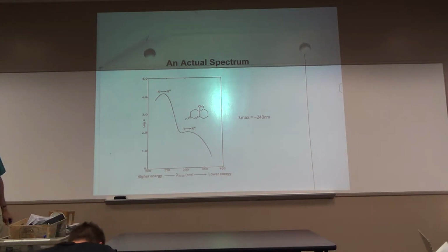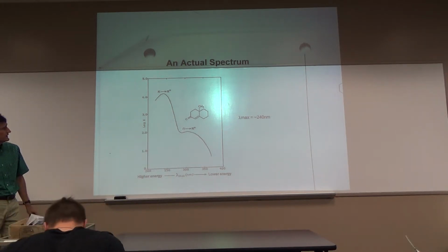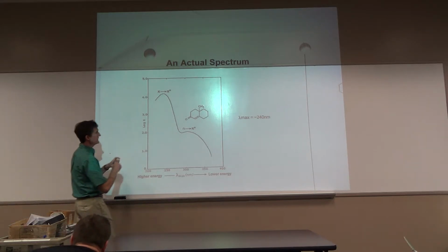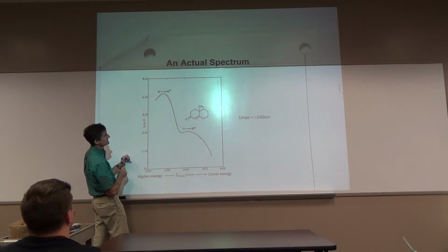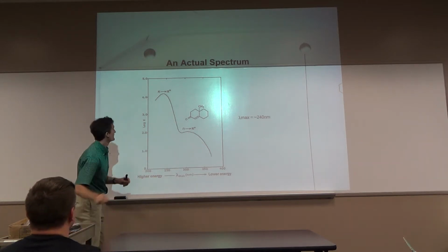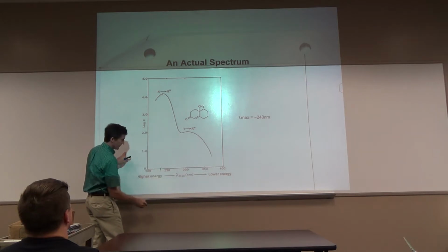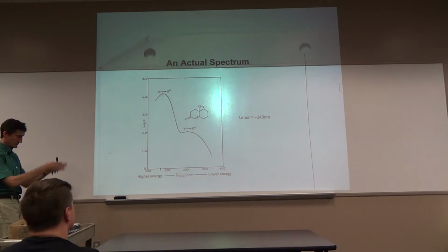Okay, here's a UV-Vis of this compound, more of a complex. I don't know any common name for it, but there we go. Whoever's showing this is showing, here we go. What's the lambda max, approximately? Well, 240, right? Right here, here's your lambda max. Somebody's playing a trick on me. Lambda max right there, if we bring this down, it's about what? Well, the computer or somebody has told us that's 240.